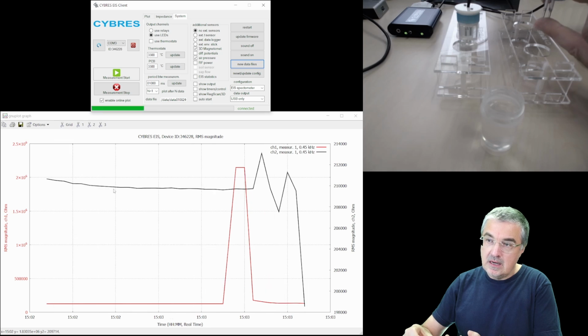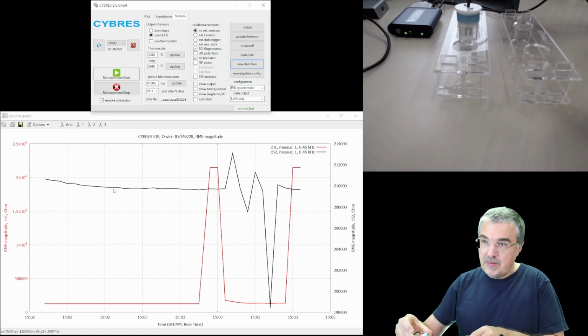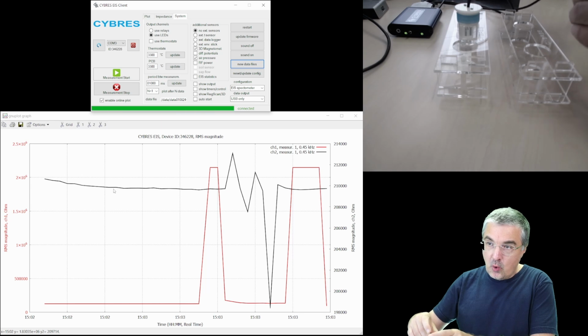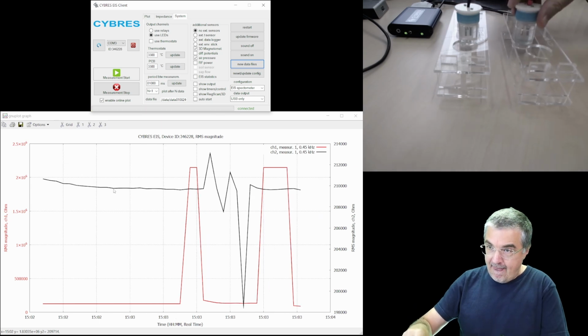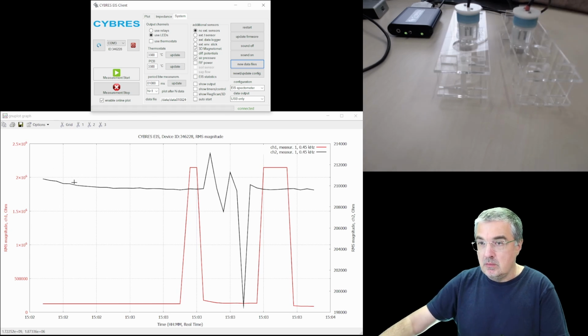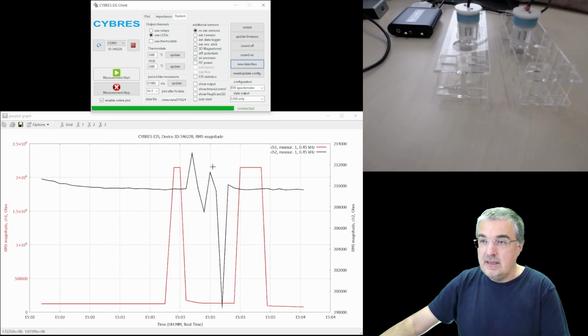You see there are large amplitude signals. Now it starts to interact. Whatever we see, there is immediately a reaction with my body capacitance through this common ground. You see it is quite well visible. In this case we increase the amplitude of the signal, and we see this interaction part and almost no noise, also no changes in the next part of a signal.